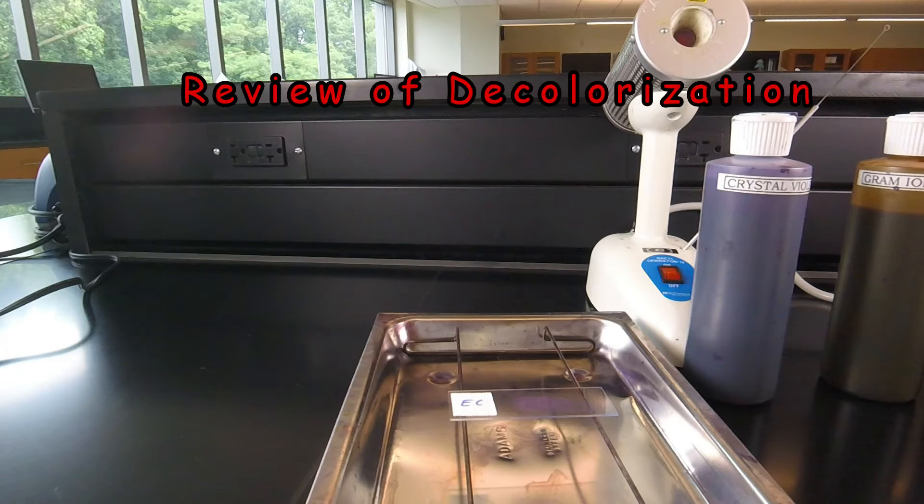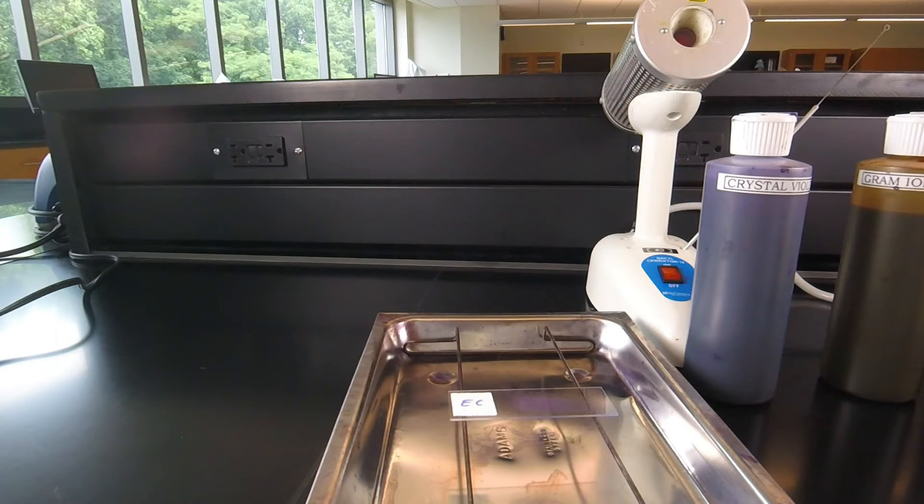Since the decolorization step is the most critical step in the Gram stain, let's review the decolorization step one more time. Now this slide has already been stained with crystal violet and treated with Gram's iodine, and now it's ready for the decolorization step.